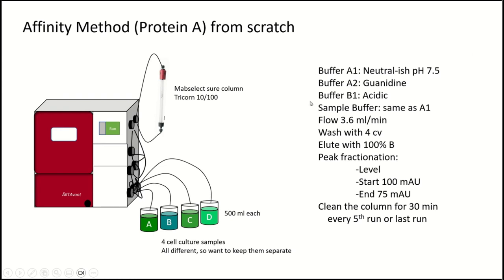We're going to run over a map select short column that's a trichorn 10, 100. We had three different buffers we're going to use. We're going to be using the sample pump to load them all. So some of the sample lines were going to be in the running buffer, the neutralish pH 7.5 buffer. We had some other specifications at least for the method.